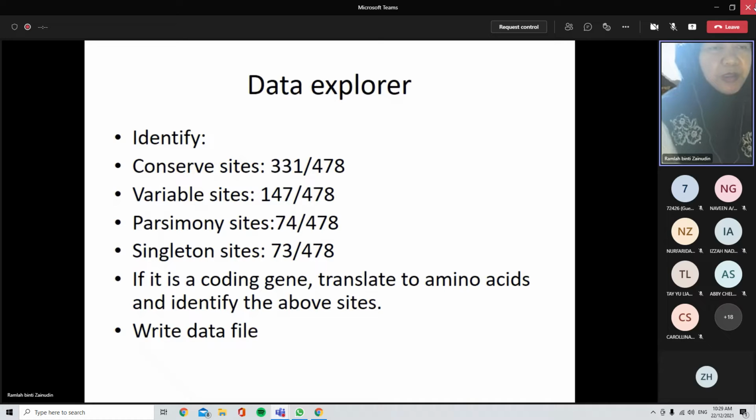relationship to be solved. Kalau tak boleh solve, that means very low parsimony signal, that means you have to choose another gene, ataupun you have to add up the sample size. Instead of 400, you have to add up maybe 3,000 bases, so that there will be variation to infer the phylogeny. Okay, so this is important, that you have to look at the variable sites.